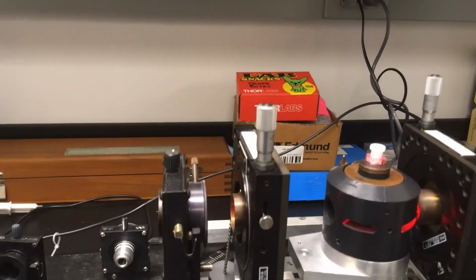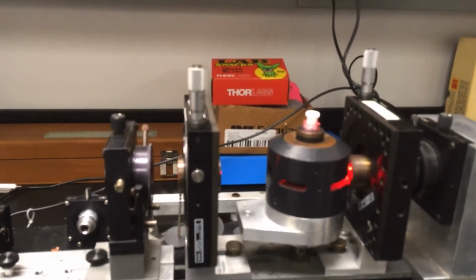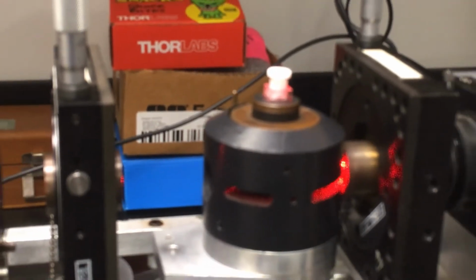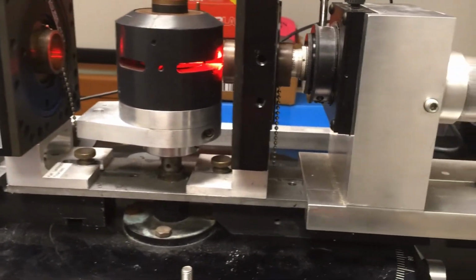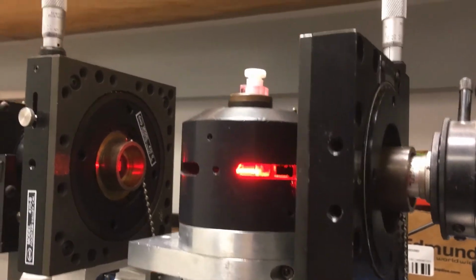And then you'll see we have here the sample itself, which is held, in this case, in a square fluorimeter cuvette, and the beam comes into it. You can see the scattering from the sample as we go through here. Okay, you can see pretty clearly.